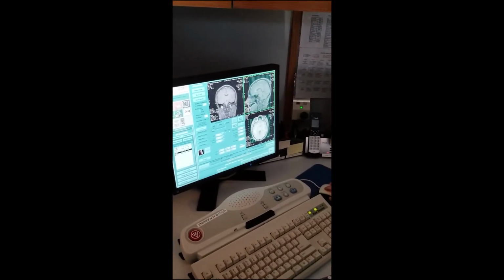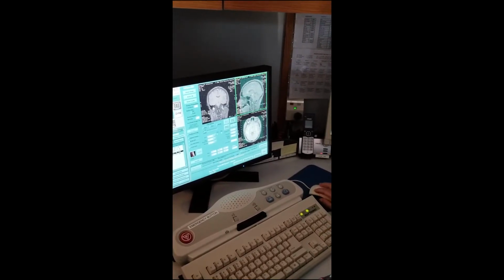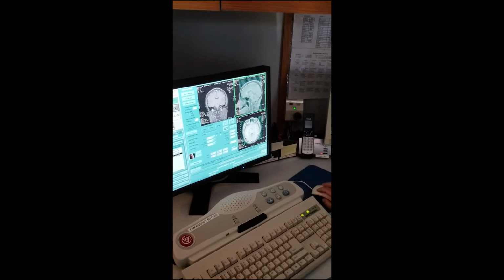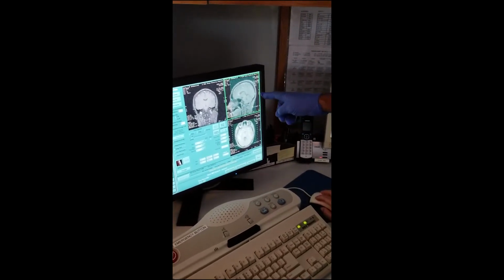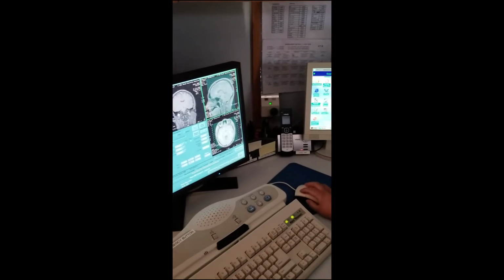Okay. So now you want to go a little bit more forward. Just move the whole stack a little bit, a little more. I'm going to show you that some of those are going to be air, not so much tissue in there, because if somebody has an injury back here, of course you want to take the whole thing.